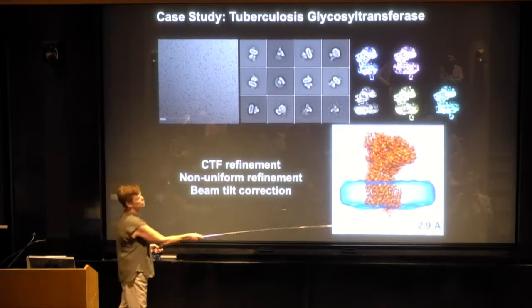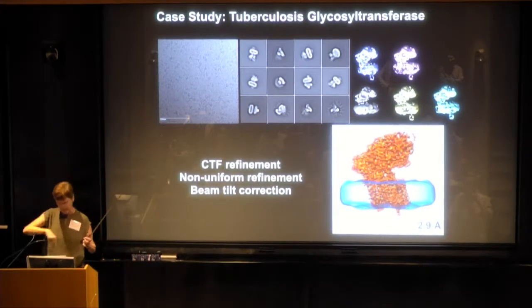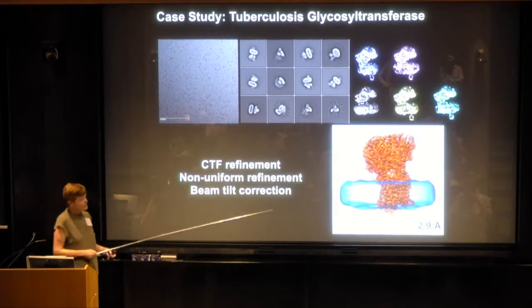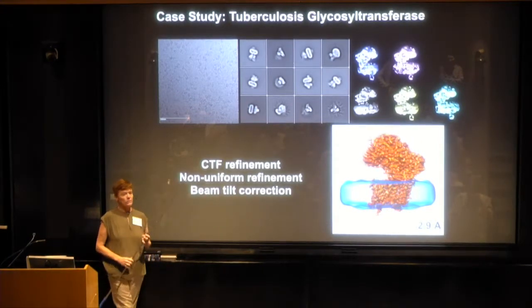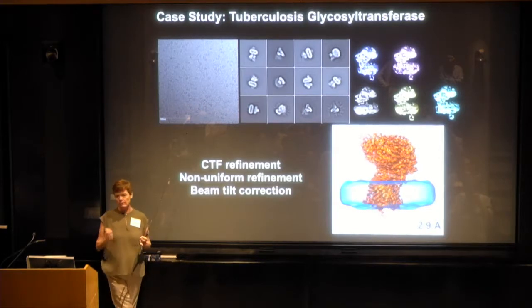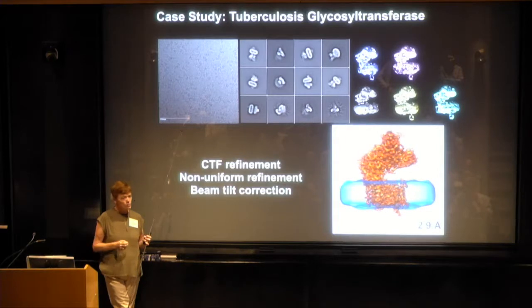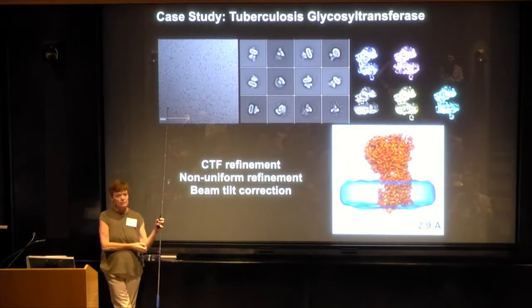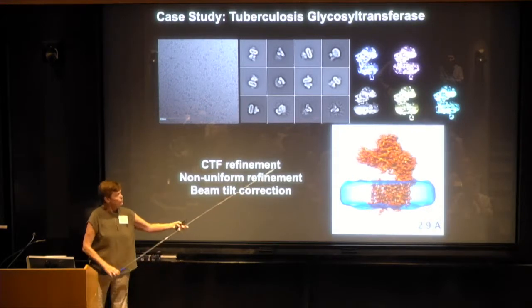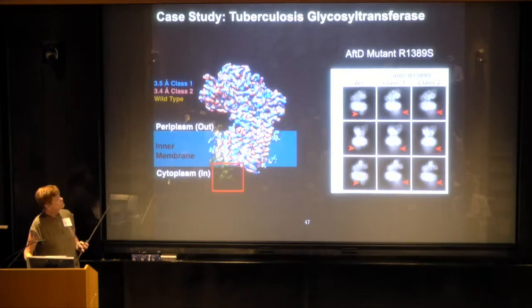And that's really what squeezes out these last few bits of resolution and lets us go to sub-3. And sub-3 is an important milestone in cryo-EM because that's where you can really see a drug. So the pharma companies want to be sub-3. If it's 3.8 or 4, it's not so good because you can't really see the chemistry of how their drug is binding to this molecule. So these are important things that you have to do in order to squeeze that structure.